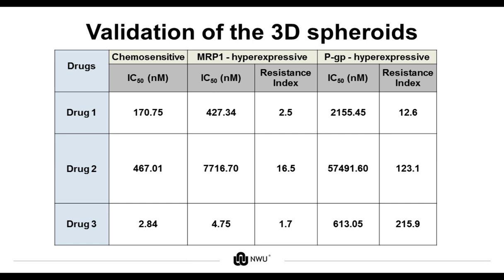The spheroid models should be validated with well-known standard anti-cancer drugs for which a vast number of published data are available. Our 3 spheroid models are treated according to available clinical or in vivo trial dosages with standard anti-cancer drugs for 21 days after reaching dynamic equilibrium.